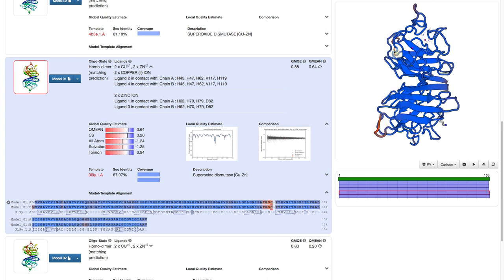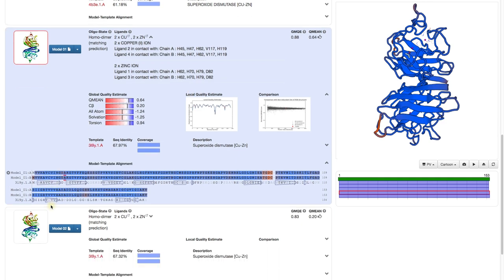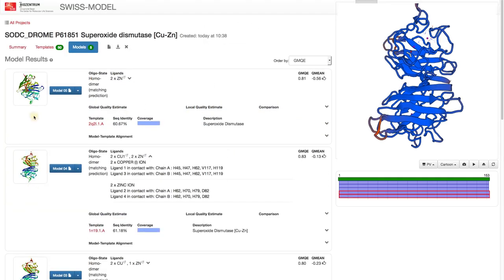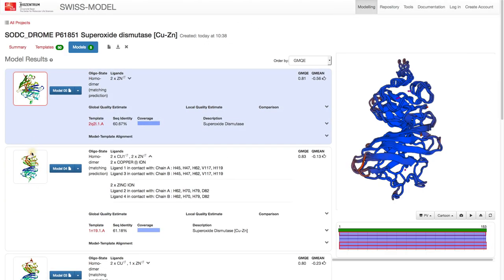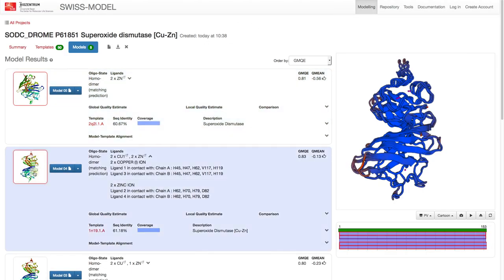This is also reflected when we select several models. See how the core aligns very well, but the loops are different? This is quite expected.